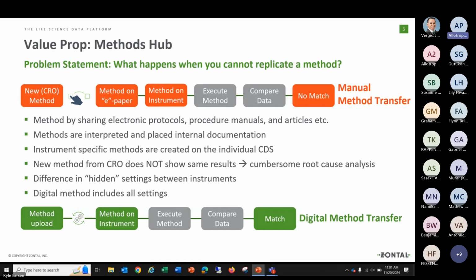When you look at the digitalization of the lab, this is not massive amounts of data. This is not super complex data, but it's extremely valuable data to know which method you ran and which version of your method you ran to produce these outcomes. So the idea was we create a digital method that you can upload to a server and somebody else can download it, and it doesn't matter on which instrument vendor you actually run that on, and to actually be able to recreate the measurement.